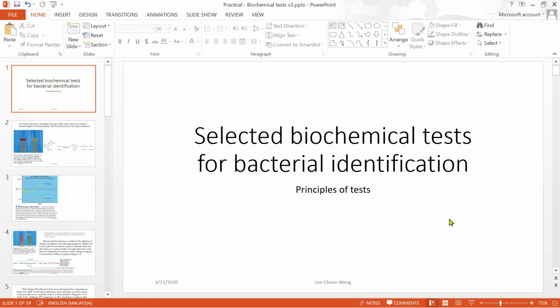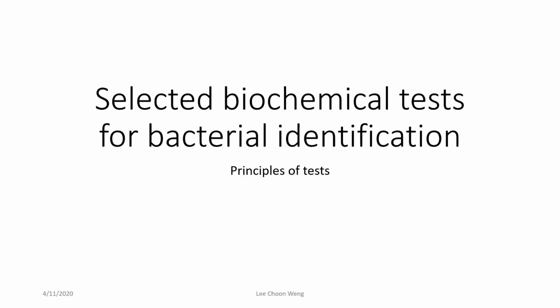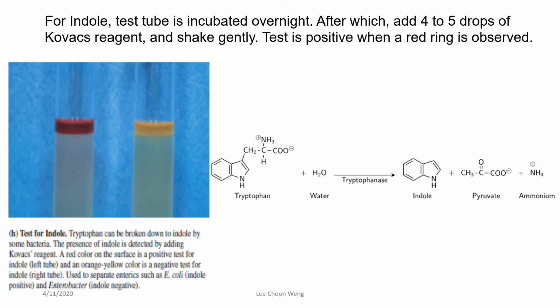For today's practical session, we'll be looking at some of the biochemical tests that we use for bacterial identification, how to carry out the test, and the basic principles of the test. So the first test is the Indole Test.